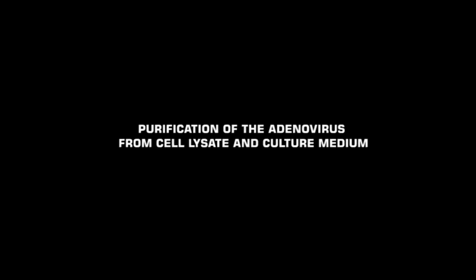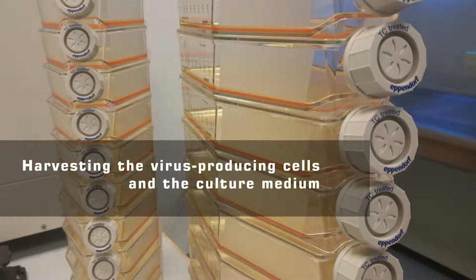Here, we will present an important step of the methodology, the purification of the adenoviral particles from cell lysate and culture medium. The purification of the adenovirus starts with harvesting the virus-producing cells and the medium.